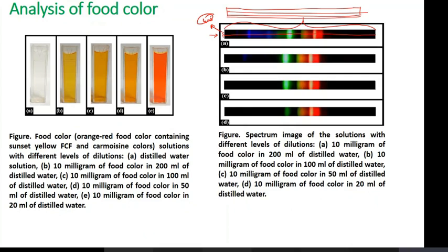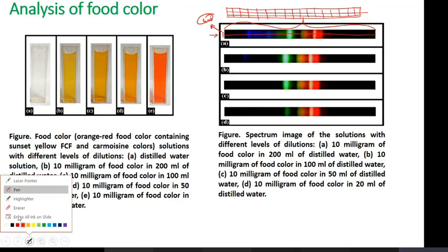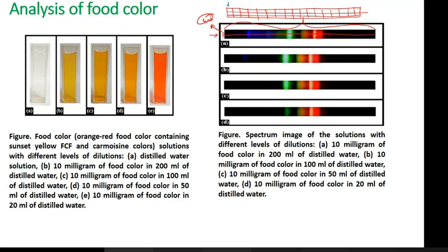Here I have shown four pixels in a column. Now this one column represents a particular wavelength. The second column represents another wavelength. So you average these 4 cells, and you get a single row like this.